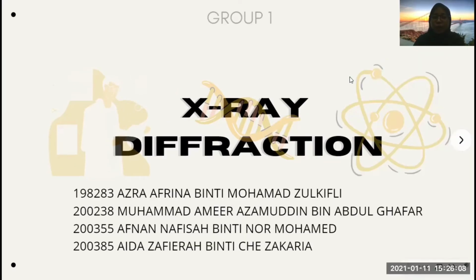So today we are going to present about X-ray diffraction. In this presentation, we're going to talk about what is X-ray diffraction, Bragg's law, how to get data, method, and the application of X-ray diffraction.